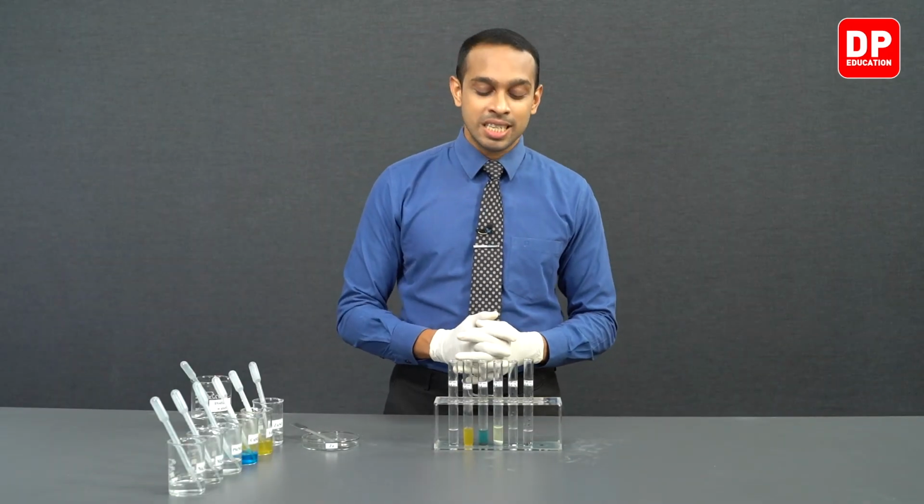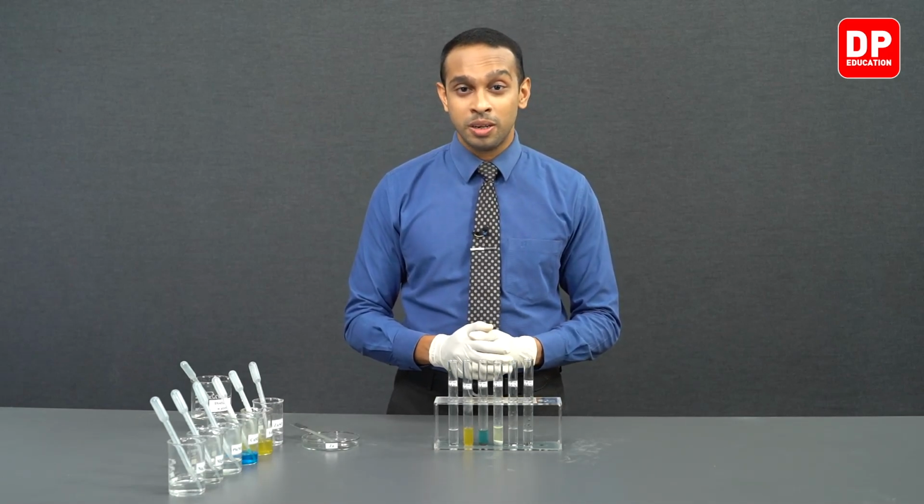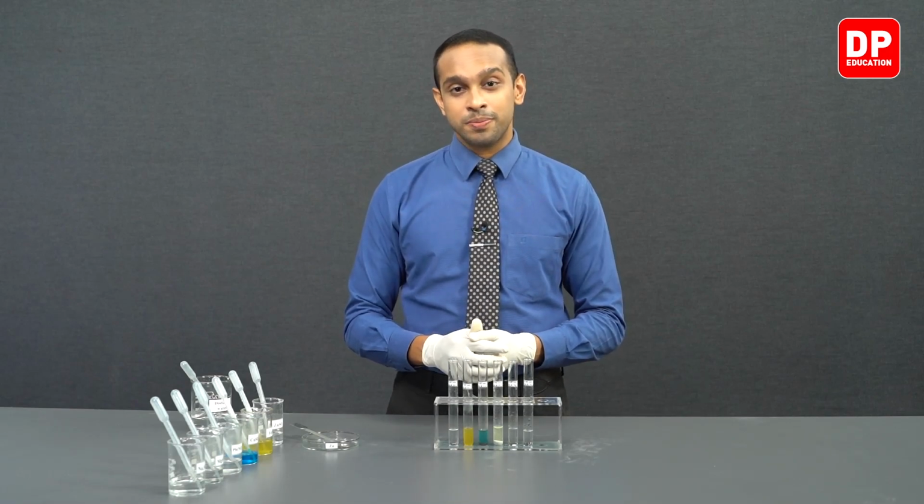But sodium and magnesium metals are more reactive than zinc, so therefore you would not observe a reaction taking place when we add a piece of zinc into sodium 1 plus or magnesium 2 plus aqueous ions. Now students, with this, the main parts of our experiment are concluded. Let's go over the summary of our experiment.